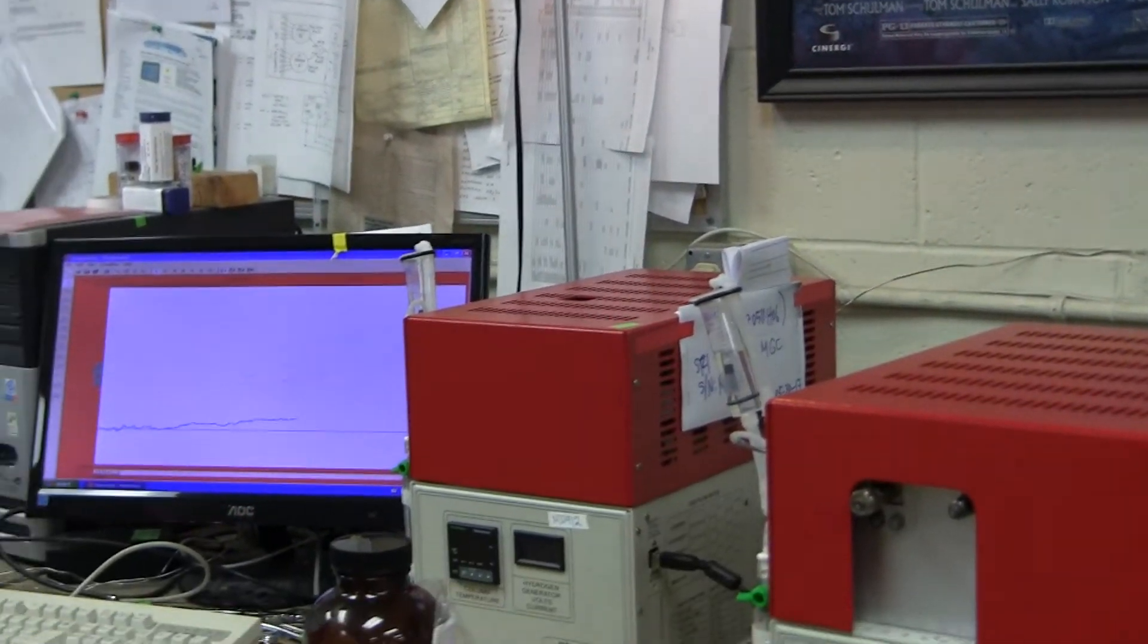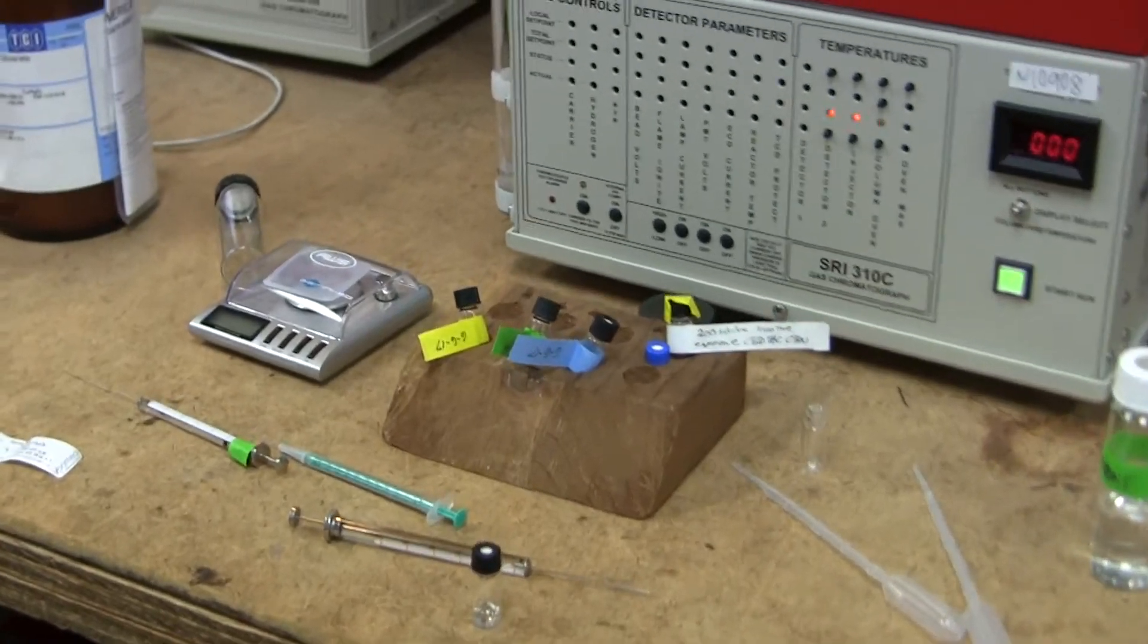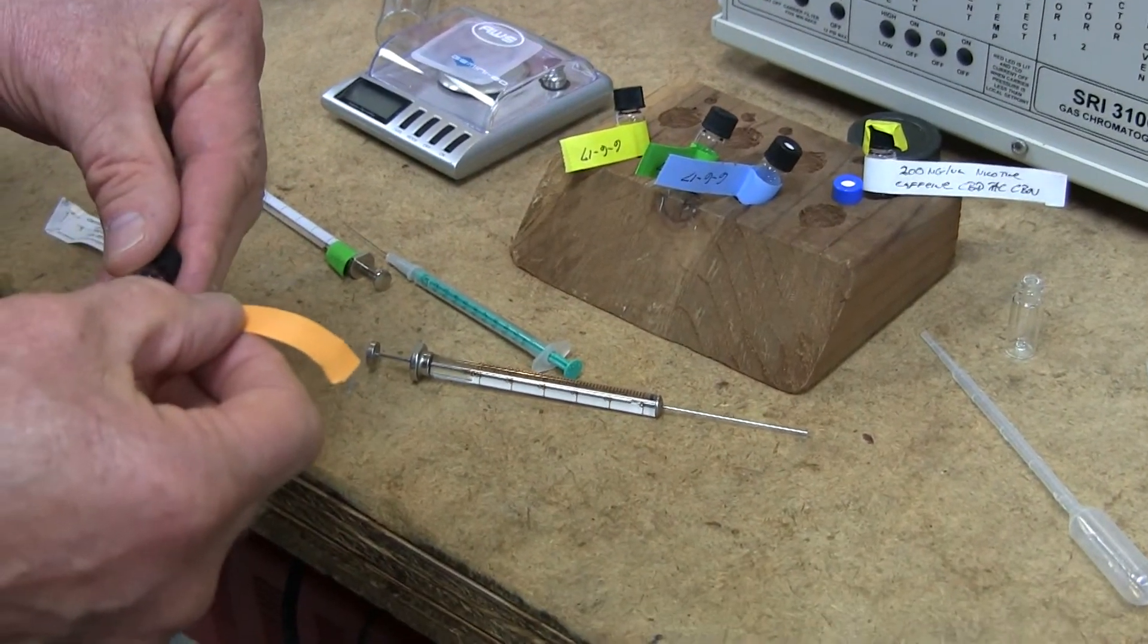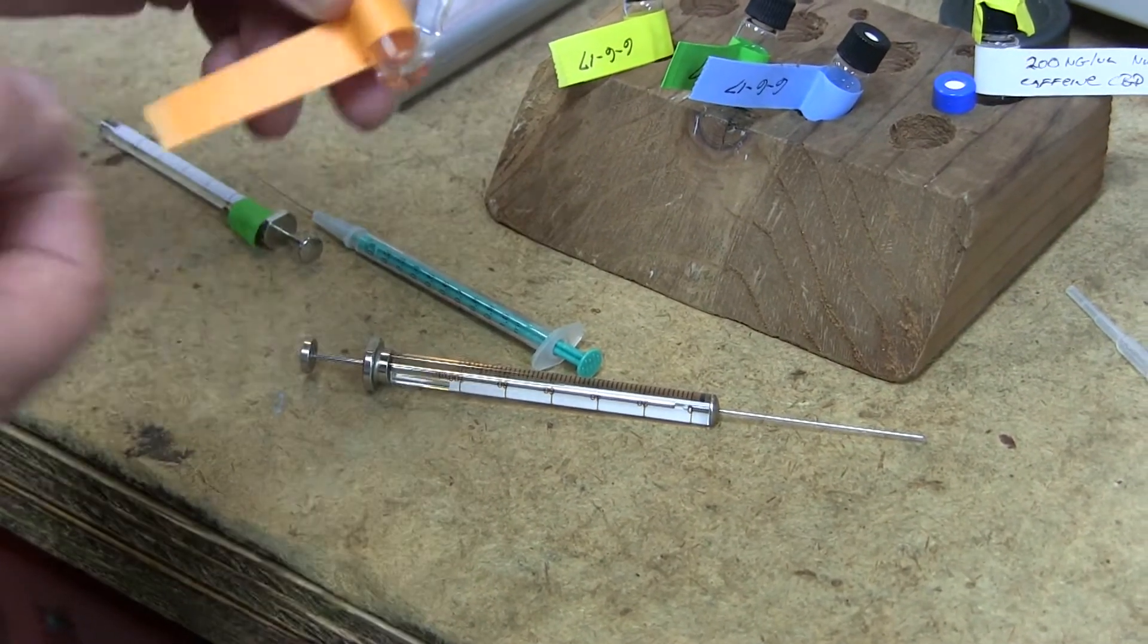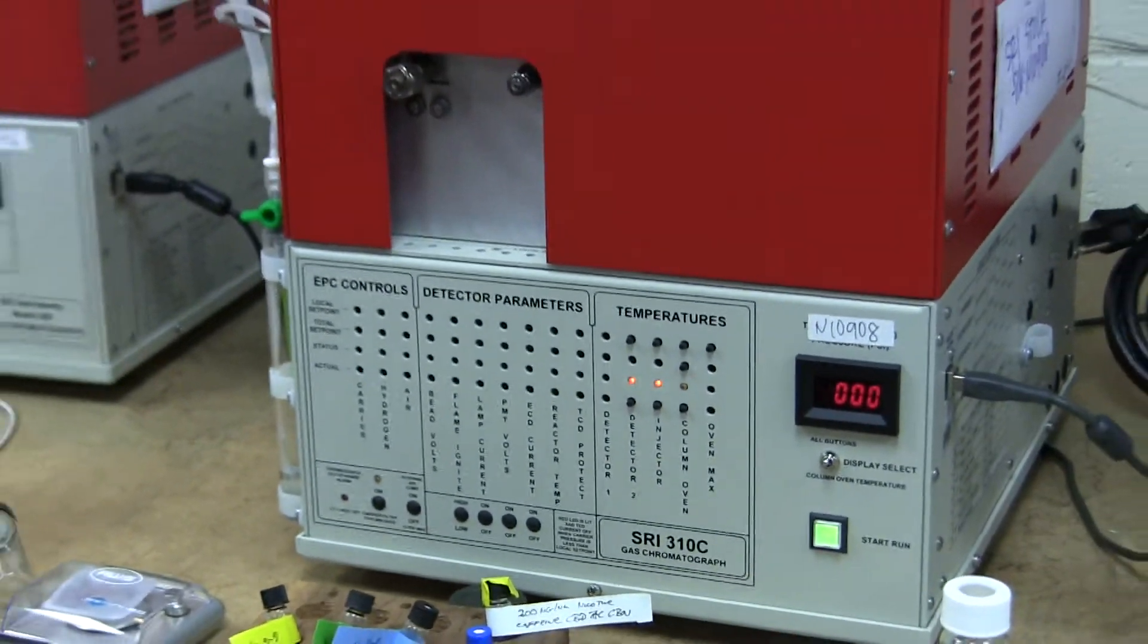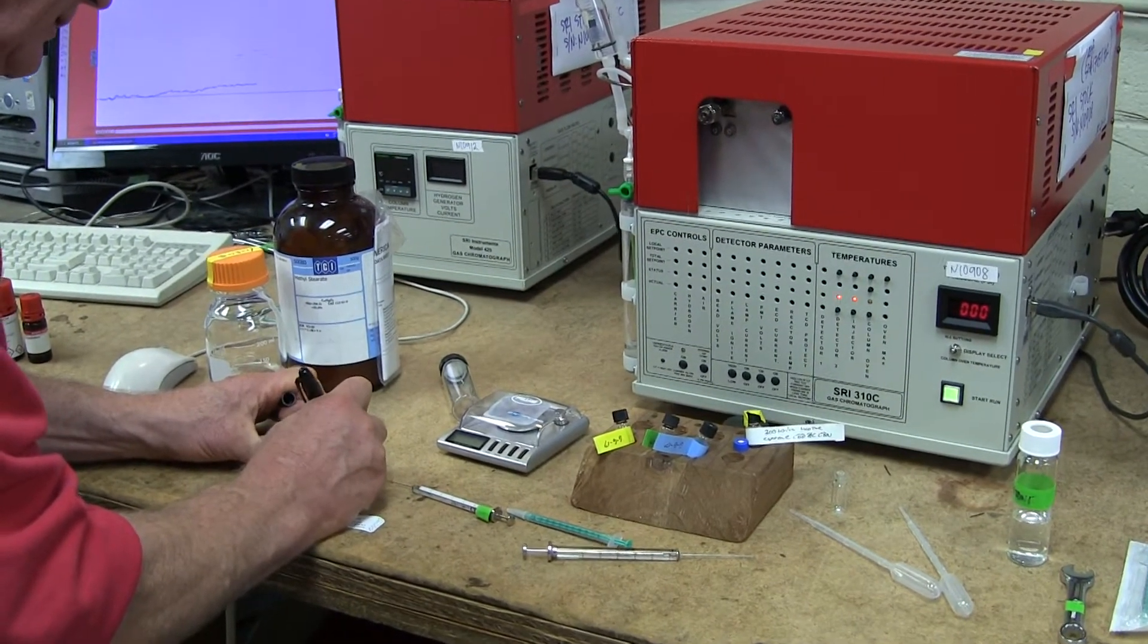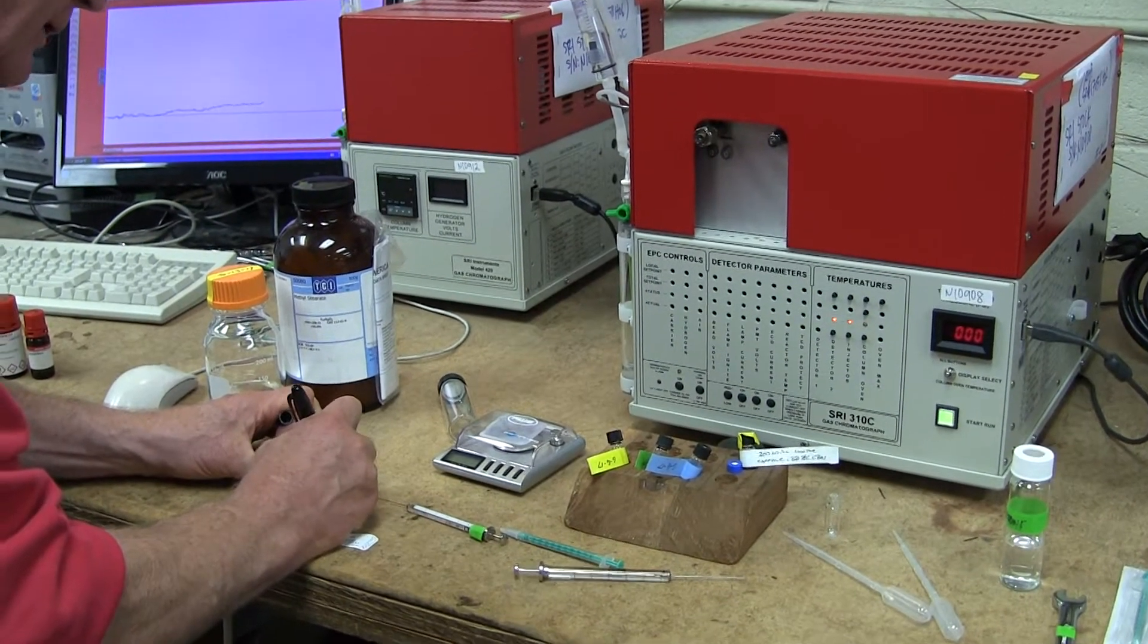So in the bottle, there should be a total of 300 microliters of liquid. So I'm going to label that up. And we are going to label this and call it CBD, THC, CBN, 333 nanograms per microliter, okay?